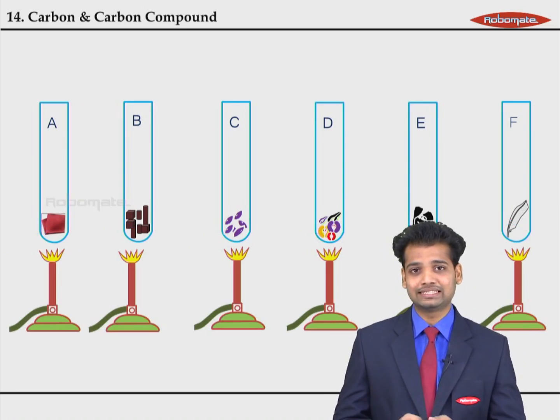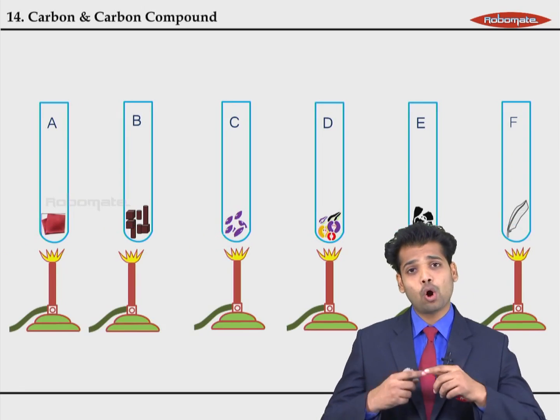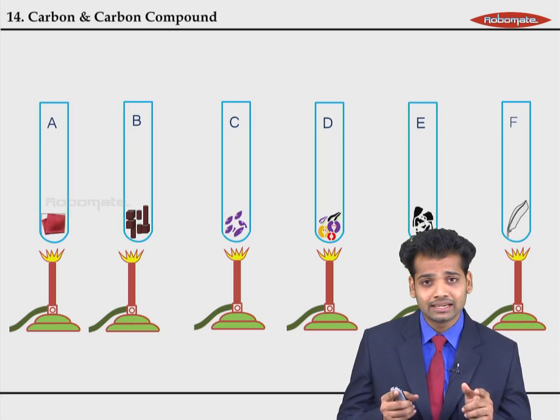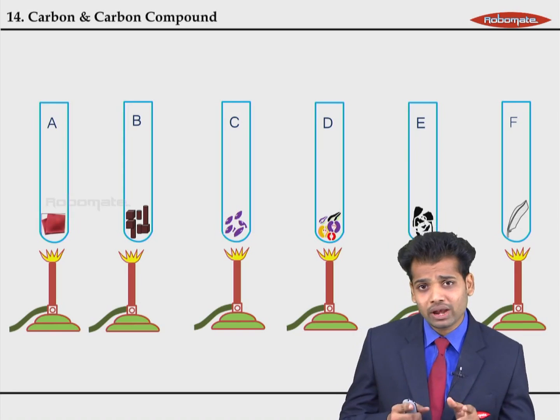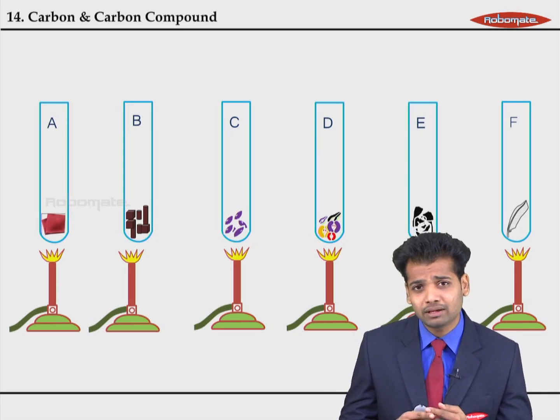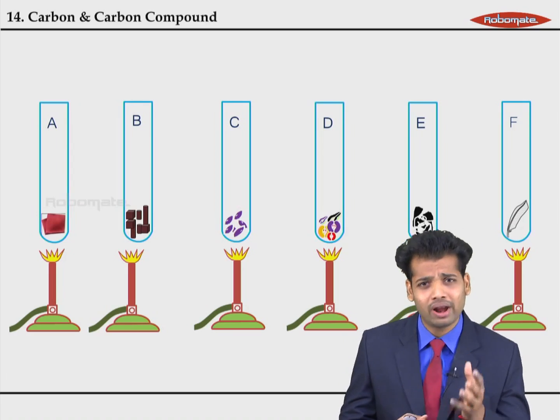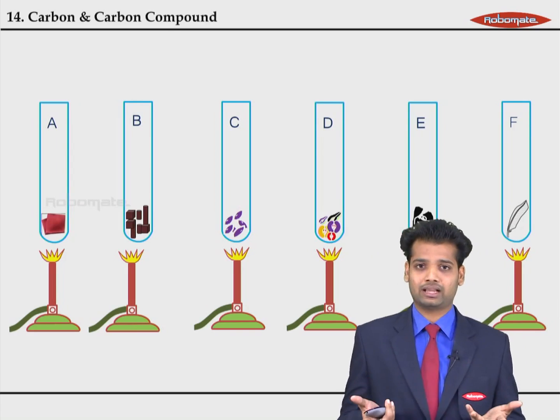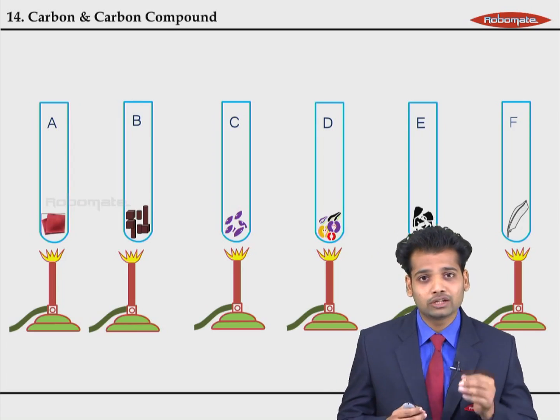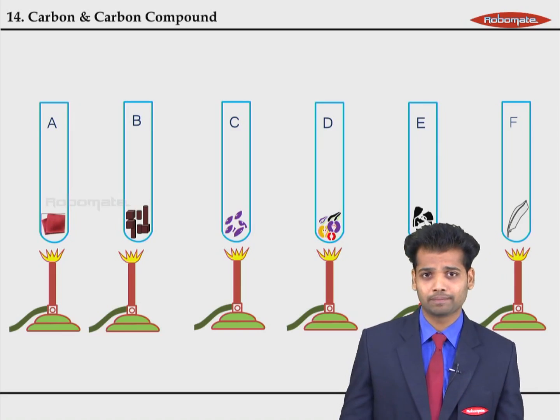I'm going to burn these things up, and when I burn these things up, I find that all of the things change their color to black. Now, this is a query that we should always think about. If the color of the flame is orange or red or yellow, why are these substances turning black? Why do we associate the color black with anything that has been burnt?